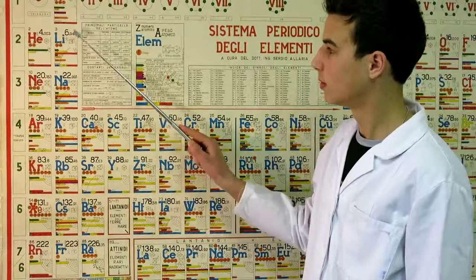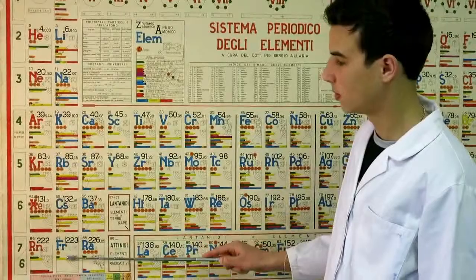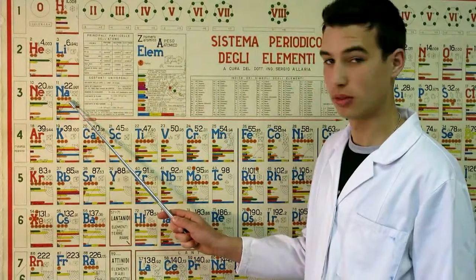We wanted to investigate the chemical properties of alkaline metals. The alkaline metals form the first group of the periodic table, a family of elements that show similar features. The alkaline metals like lithium, sodium and potassium are stored under oil because they are extremely reactive with oxygen and water vapor in air. They don't look like metals. If we cut them with a knife, they turn out to be shiny and soft. We are studying the reaction with water.